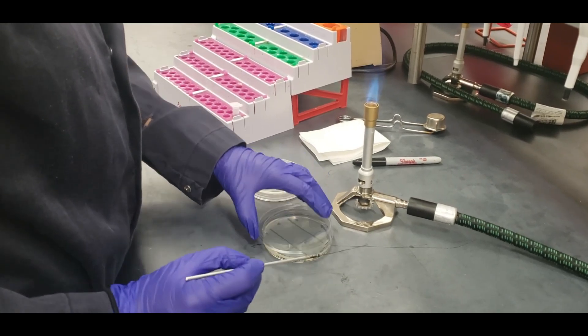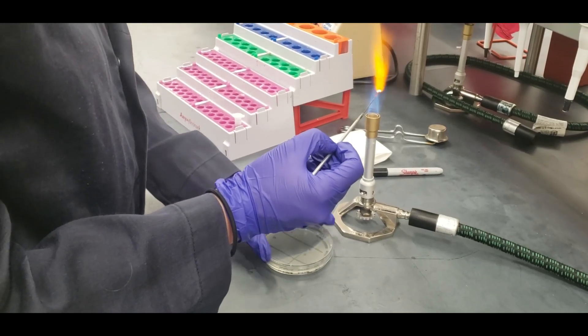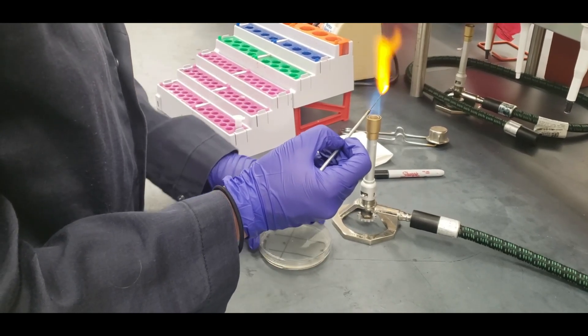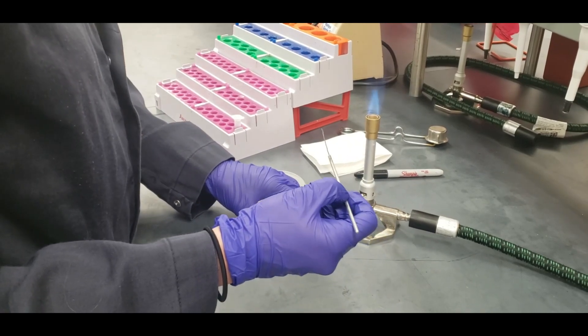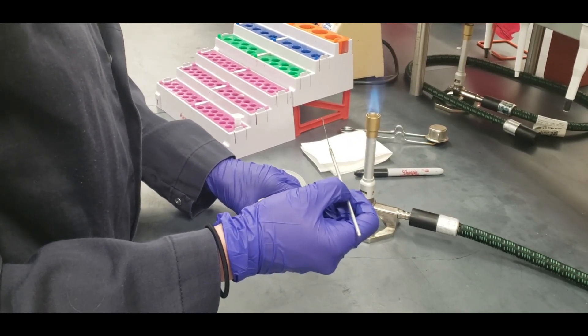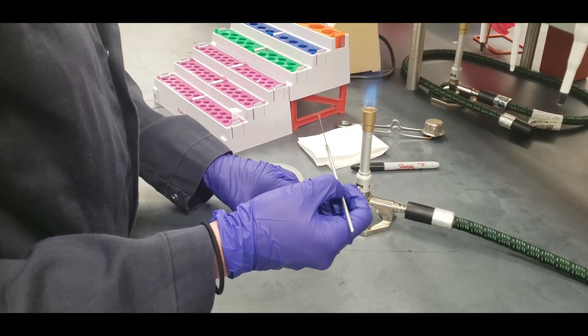Like I said, make sure you don't cross over into any other quadrants. Lastly, you're going to repeat the steps of sterilizing your loop, and you're going to only pull one time from quadrant three into quadrant four.